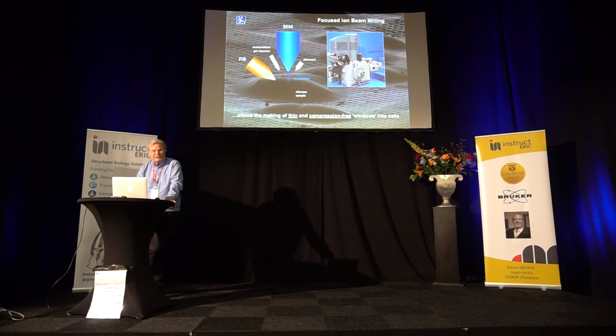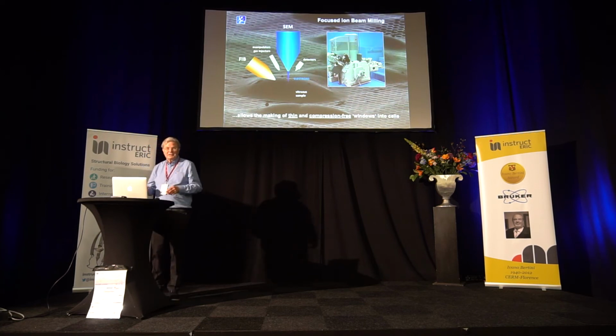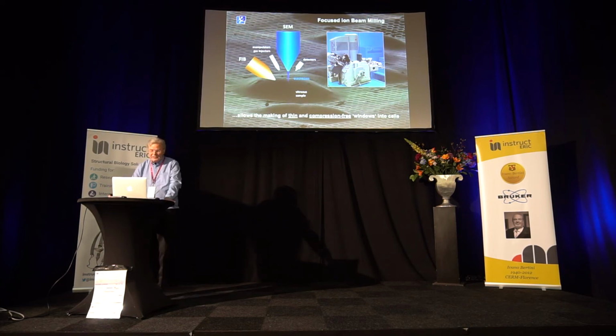There was hope in between that cryosectioning, pioneered by Jacques Dubochet's group, would be helpful in thinning samples. I could hardly ever persuade a graduate student or postdoc in the lab to do cryosectioning. We tried for a while, but we were also frustrated by the fact that it caused very serious artifacts. I mean, vitreous ice is quite compressible, and so the compression can amount to something like 30-40% or so.